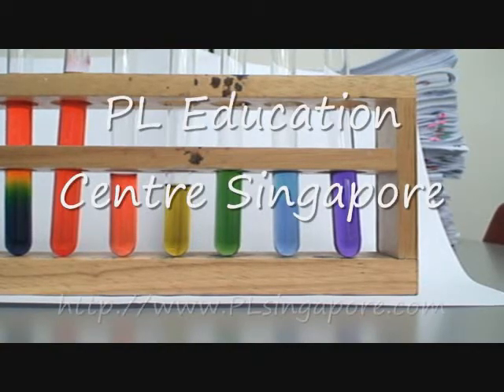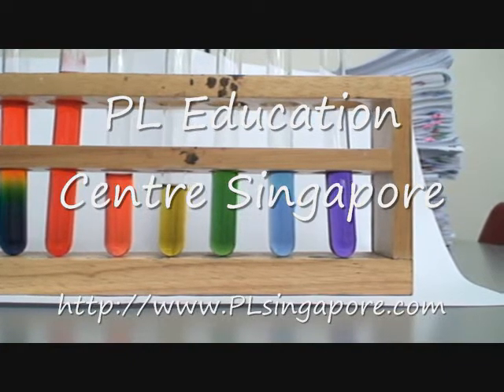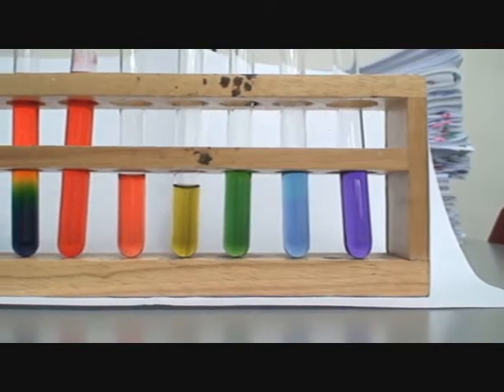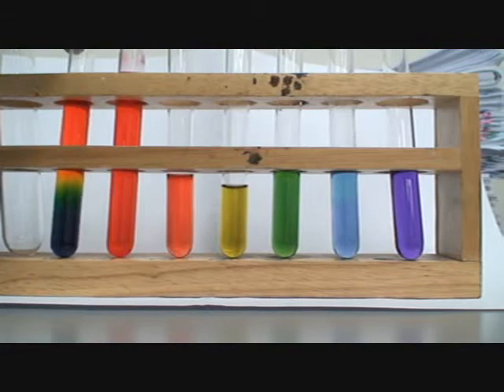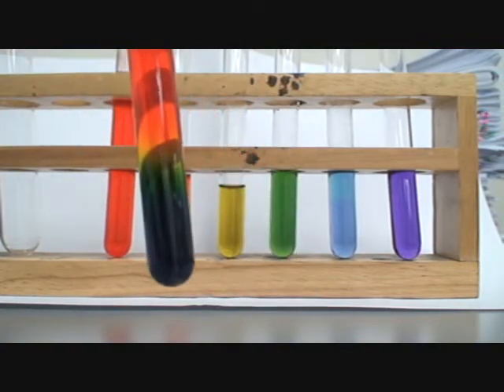These are six test tubes of different colors of universal indicator. I'll tell you how exactly we got this. On the left you have one test tube that almost has all six colors there in one test tube.